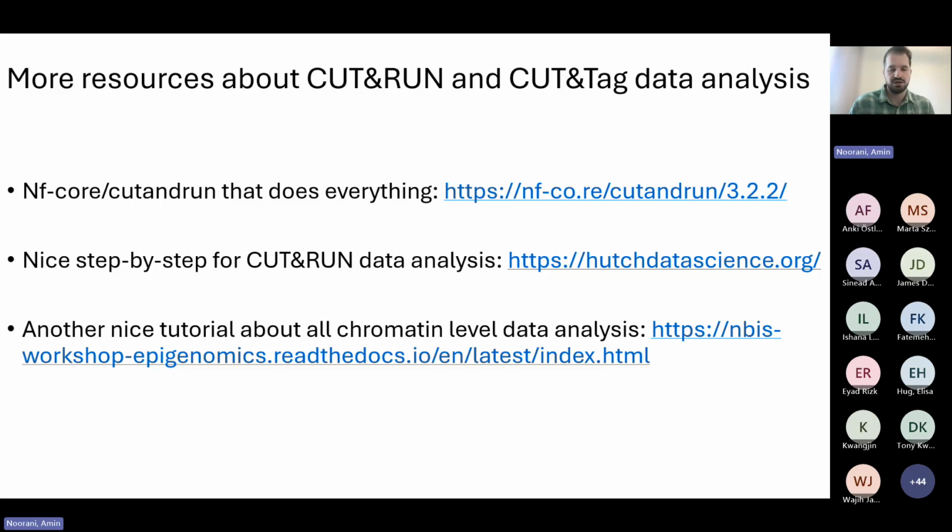And you can change all the parameters as well. So it's very flexible, and I suggest you not go through everything one by one. You just run this all at once, and once you get into trouble, then you go back and see what the parameters were, and all the QC that we talked about, to see what might cause the problem.